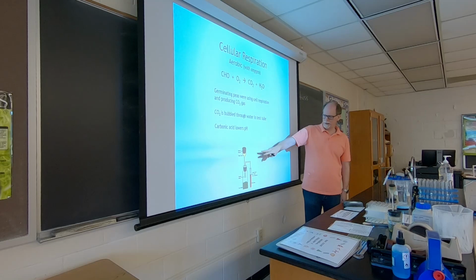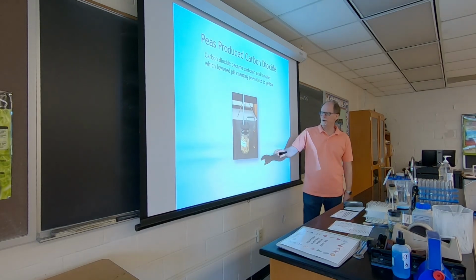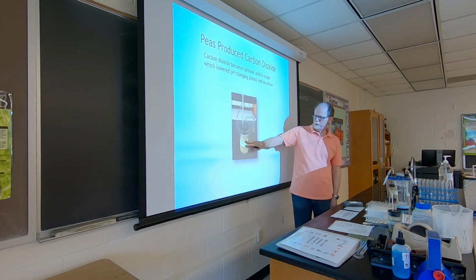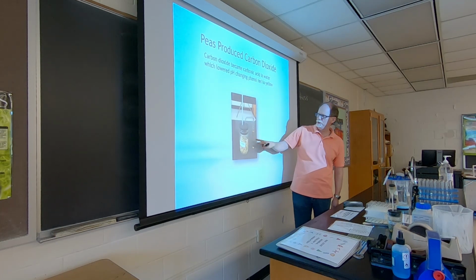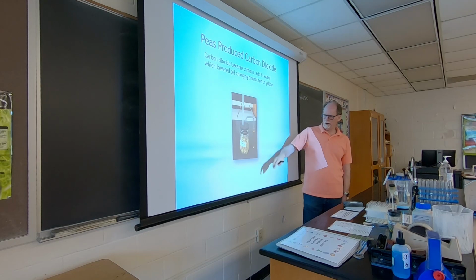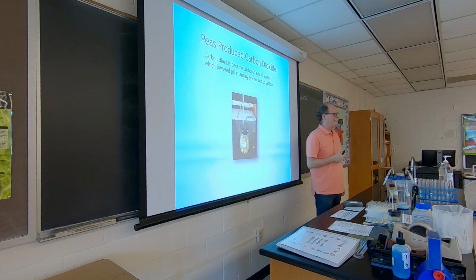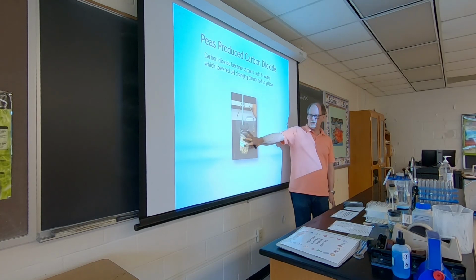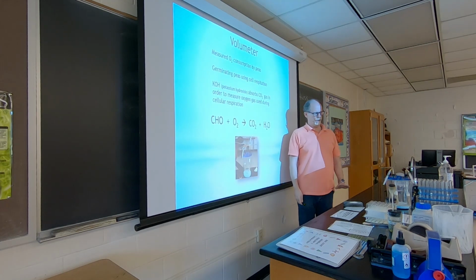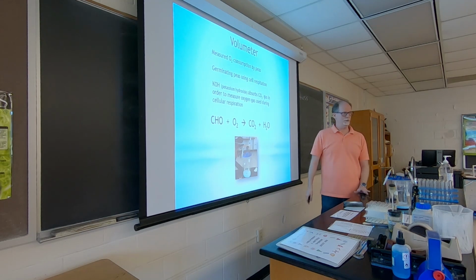At the end of this experiment, it starts off red, but we bubble the gases that were generated in the tube from the germinating peas through this tube by adding water, like I did. This one's only orange, but mine turned a nice yellow. So it worked. On the practical, you might see this image and I'll ask you questions about it. It shouldn't be that difficult, especially if you come to this lab or watch the video.